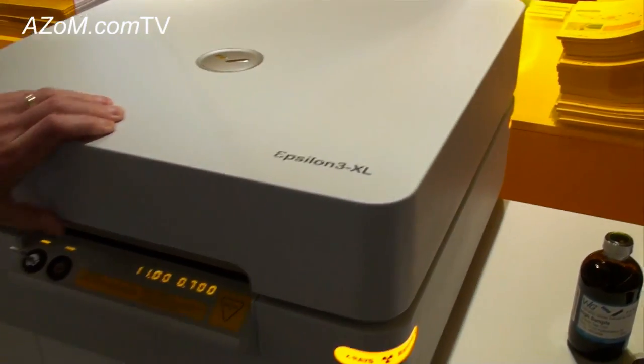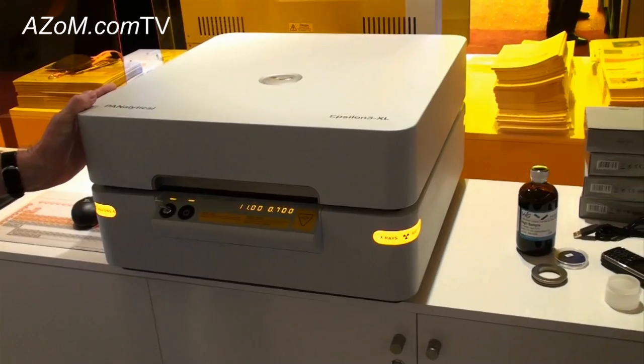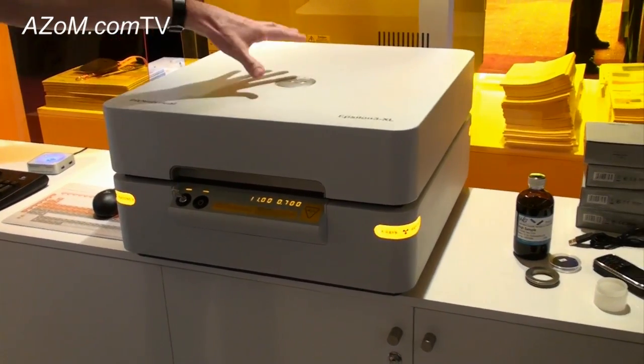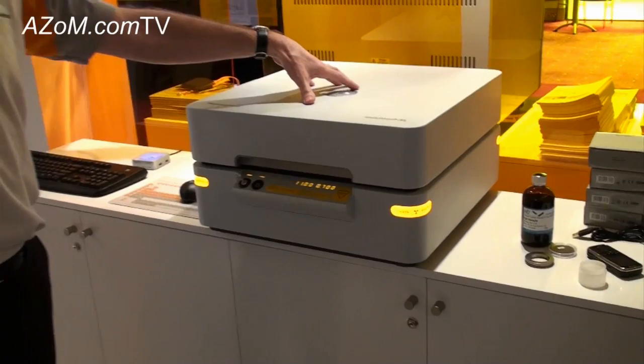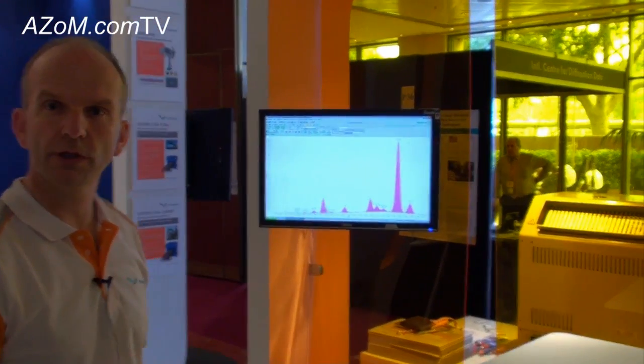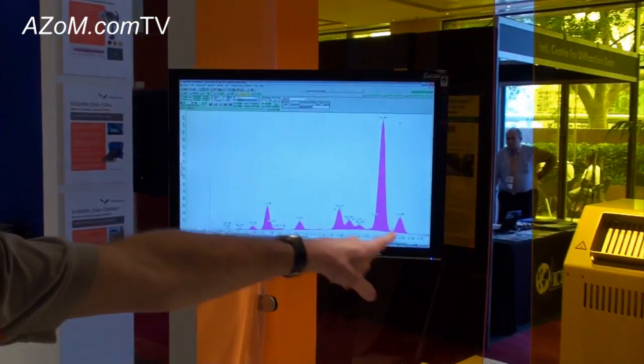The system is completely safe, rated to the latest standard of radiation safety. The sample can then be analysed, and a typical spectrum which you would generate from such a fused glass bead would be something like this.